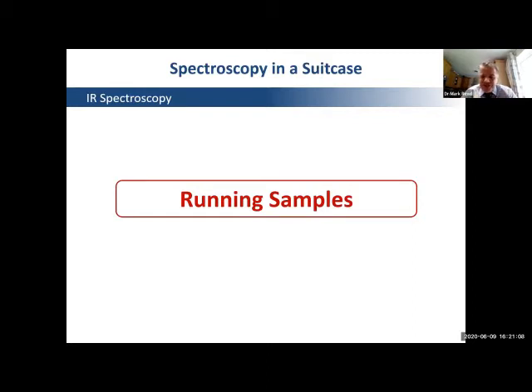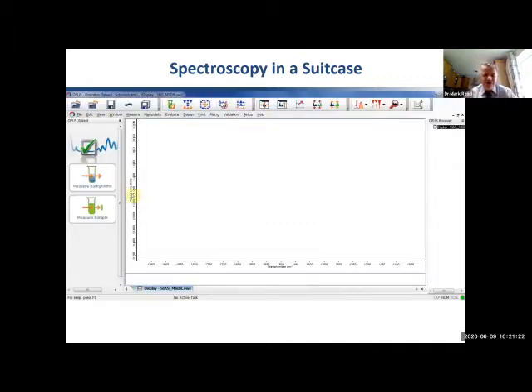Before I show you the instrument, I'm going to first of all share the screen of the laptop that controls the instrument, because it's important for you to see how this instrument works. First thing we have to do is a background correction. So when I look at my screen, this is the laptop screen. I've clicked on measure my background. And at the green bar at the bottom, you can see it does several scans.